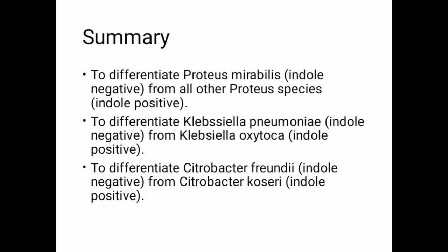Proteus mirabilis is indole negative, which differentiates it from all other Proteus species, which are indole positive. It also differentiates Klebsiella pneumoniae, which is indole negative, from Klebsiella oxytoca, which is indole positive.